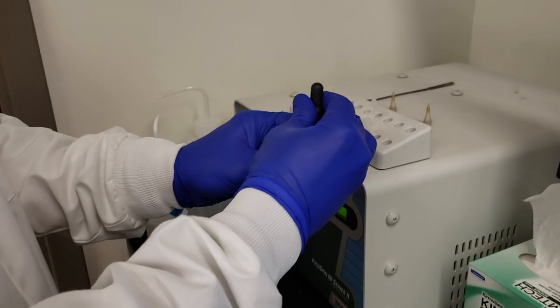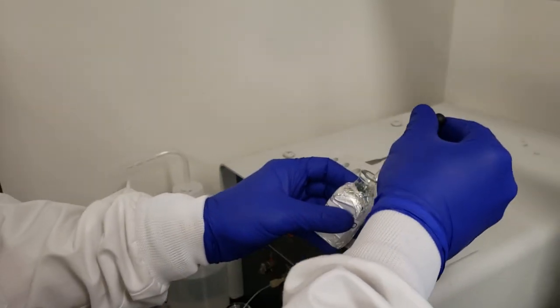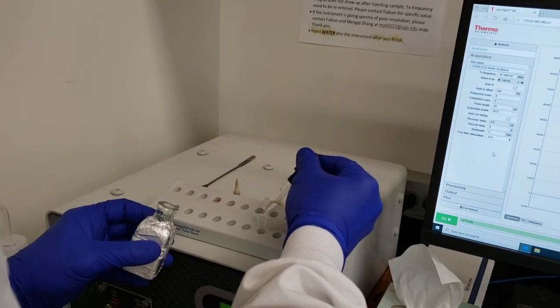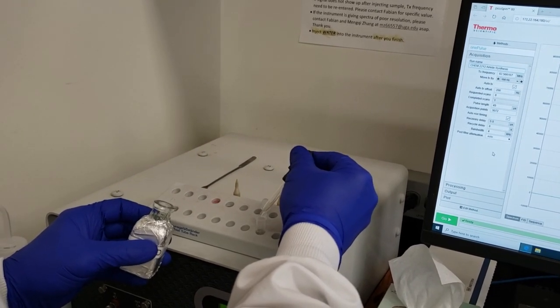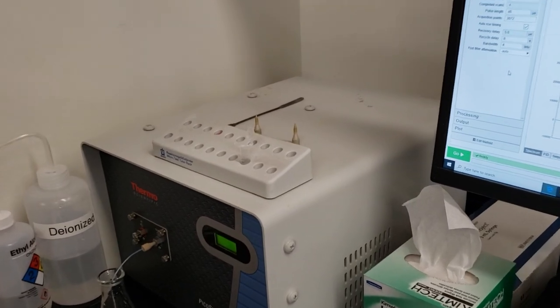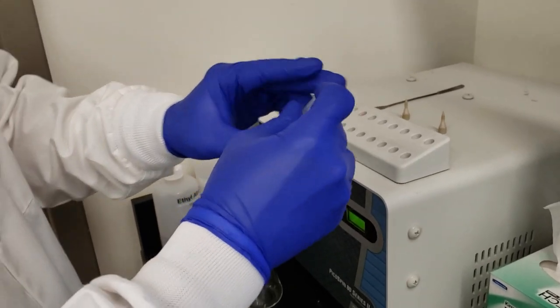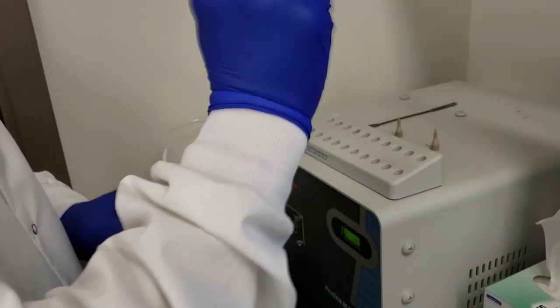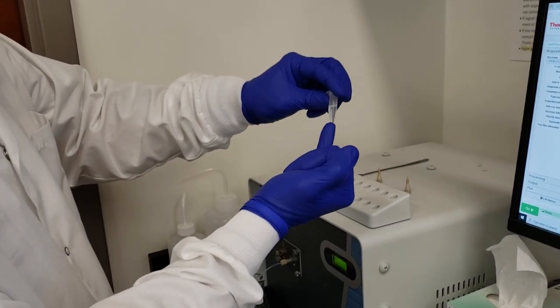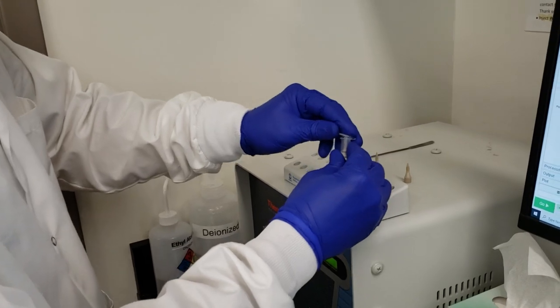Take our deuterated chloroform. Just a little dropper bottle. And I'm going to fill the tube. It's about one dropper full here. Set this back down. Close up my tube and shake. Just to make sure that everything's nice and dissolved, and as far as I can tell, I don't see any of our solid still present in that tube.